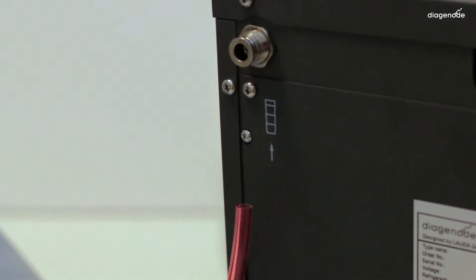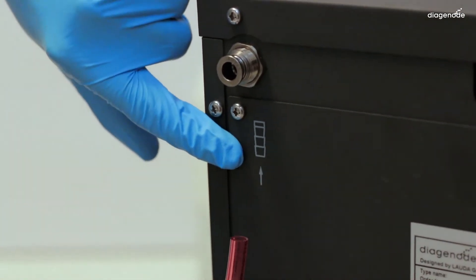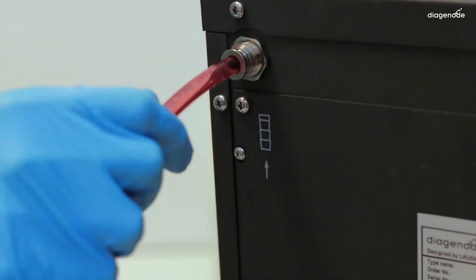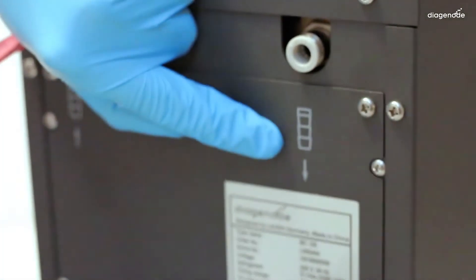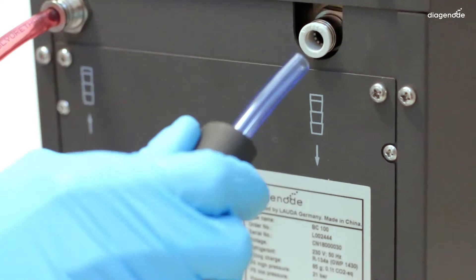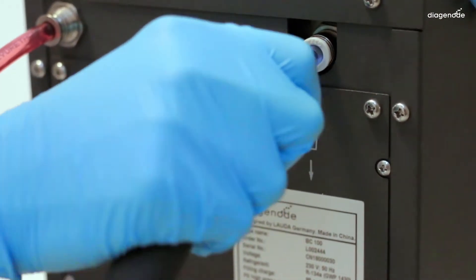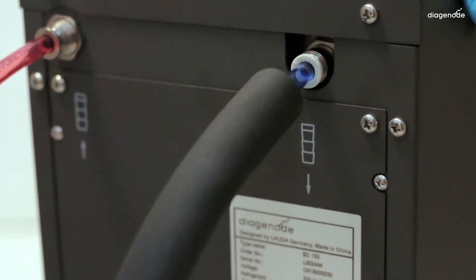At the back of the cooler, the red tube needs to be connected to the inflow and the blue one to the outflow. If they are too long, you can cut the length you need, but make sure there is enough slack.